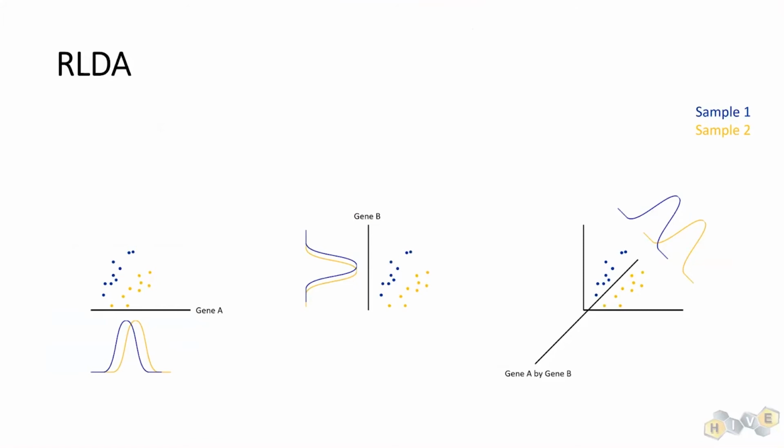And this version is, quote, regularized because it does a little bit of subsampling, in large part to improve performance by adding a small value to the data uniformly, 0.01, in fact. And that's because the algorithm can get really bogged down on tiny numbers that go on for lots of decimal places when all you really care about is the first few digits of it. And then even more so if there's a 0 probability in there, which can also really cause some problems. So this is a way of substantially improving performance, and I'll link you to a paper at the very end if you want to see an example of it in action. But the basic idea is you're just looking for features that can distinguish 2 things.